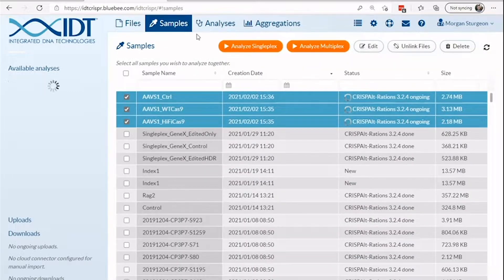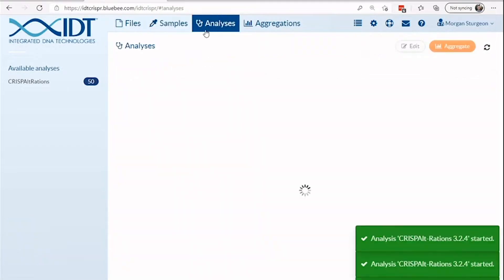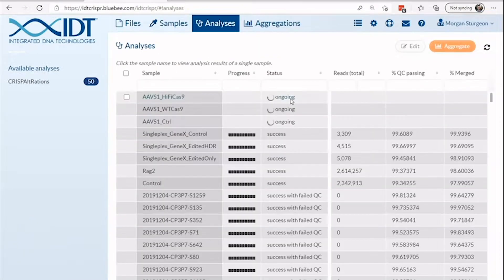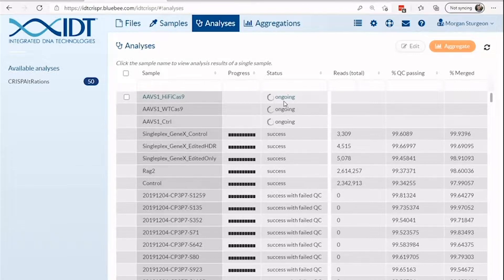To check on the status or results of your analysis, navigate to the analyses page. As soon as cloud resources are partitioned to begin processing, a progress bar will appear. Analyses typically take between 20 minutes and 2 hours. The turnaround time depends on your read depth and number of amplicon targets being quantified per sample.